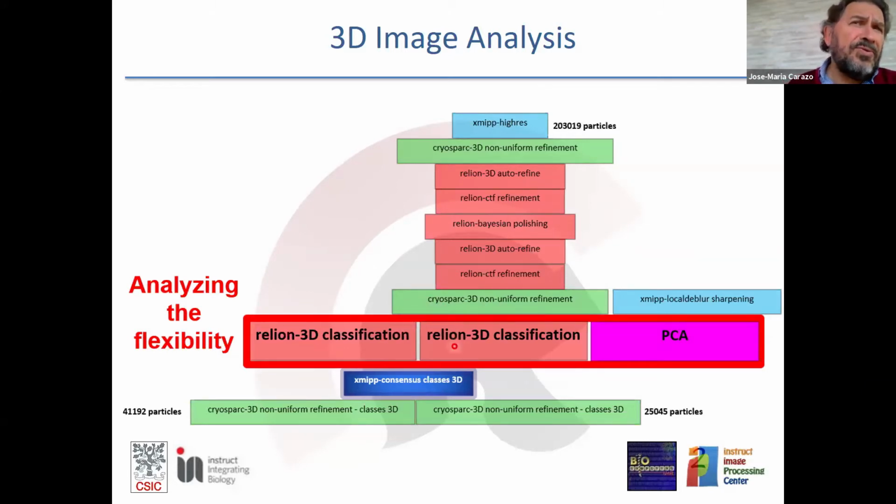First warning: when we did two classifications, about 30–40% of the images didn't come out in consistent classes or with consistent angular estimations. So this was a first warning that something was perhaps not as simple as it looked. And probably the non-simplicity was coming from the lack of discrete classes. So at that stage we said, okay, let's go for methods that do not require this discrete conformation. Let's go for principal component analysis, which is a least squares approach to finding this conformation.